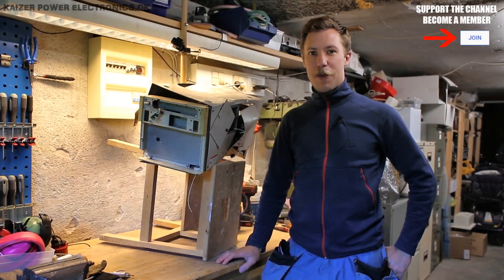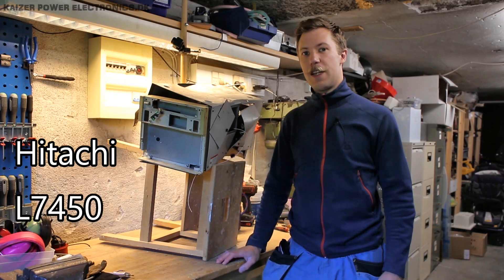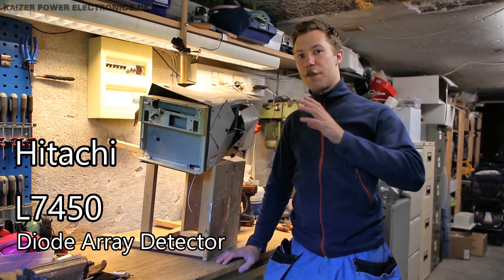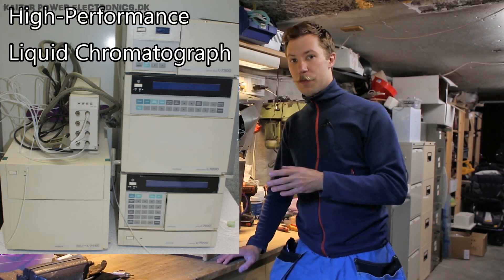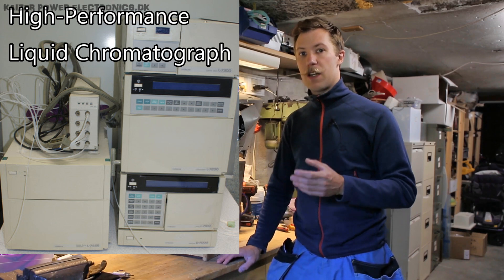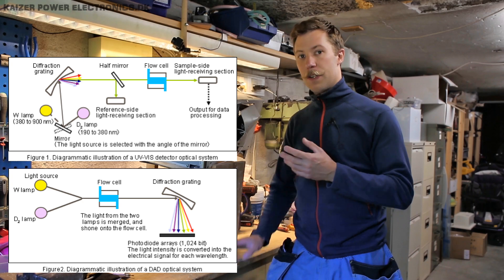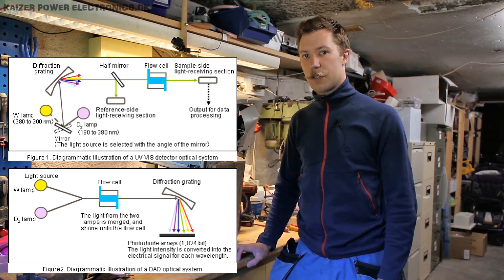Hi all, Mads Baunkamp from Kaiser Power Electronics. Today I'm here with the Hitachi L7450, which is a diode array detector, part of a Hitachi HPLC — high-performance liquid chromatography — system. It is used for analysis of liquids with visible and ultraviolet light sources.